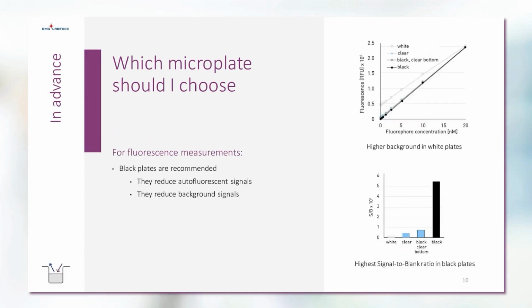When it comes to fluorescence measurements, things look quite different. Here, no light has to transmit through the plate. Excited fluorophores emit light into all directions, so the emission signal can actually be detected from the same side of the plate from which the excitation light originally came.